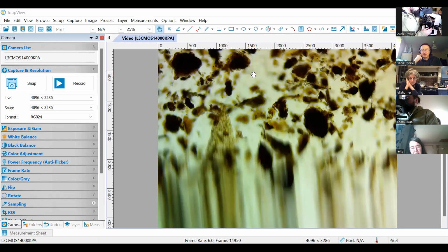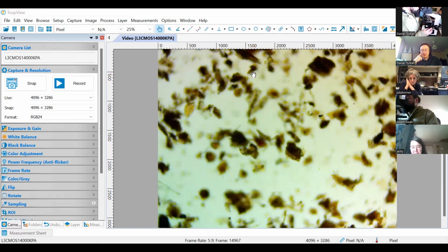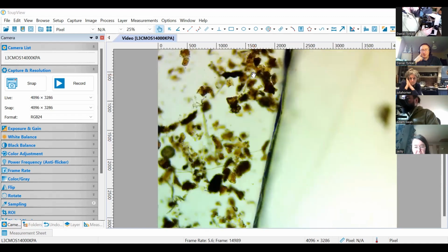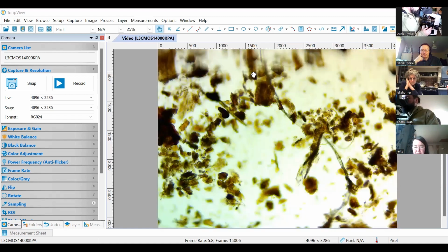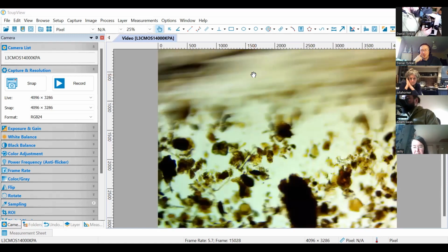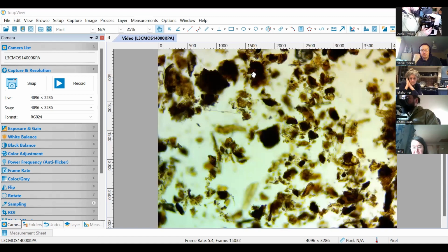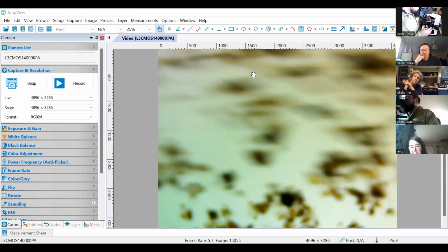We bought it. Frida, who's sitting next to Adam right now, has it on her microscope, I think, but I don't know if she ever uses it because it's not really something that we need. It's not used in any counts. It will be just used to have some fun with the microscope, I guess.